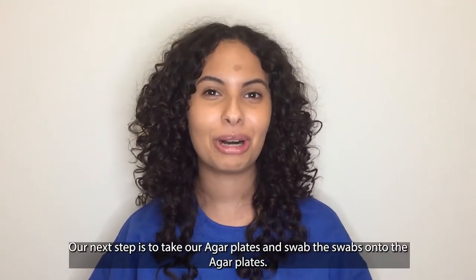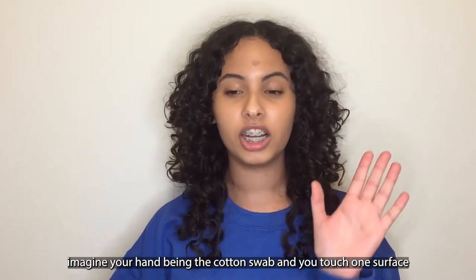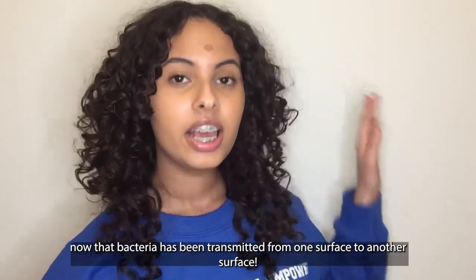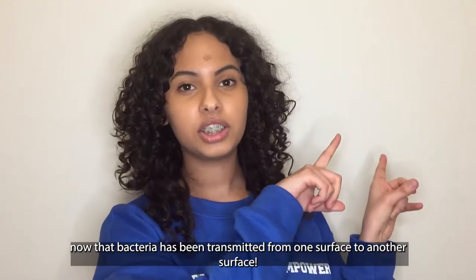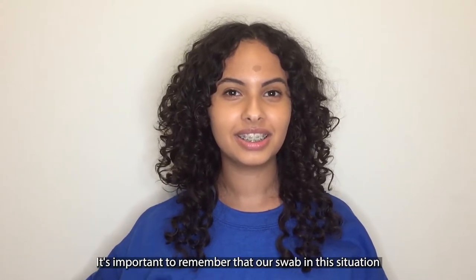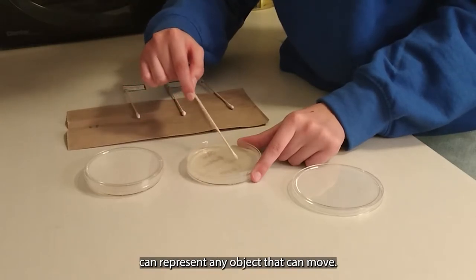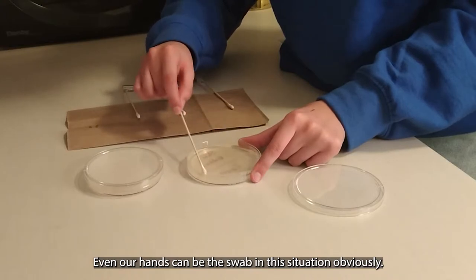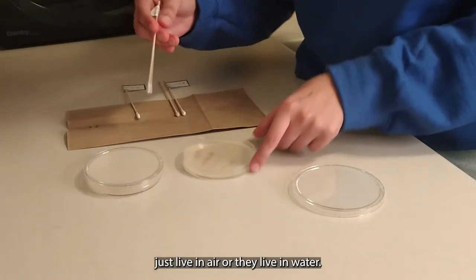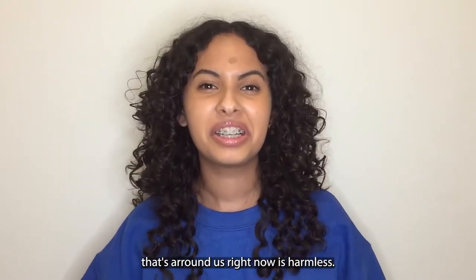Our next step is to take the agar plates and swab our swabs onto the agar plates. Imagine your hand being the cotton swab — you touch one surface and then, without washing your hands, you touch another surface. Now that bacteria has been transmitted from one surface to another. That is bacteria transmission — it's just the movement of bacteria. It's important to remember that our swab can represent any object that can move, even our hands. Some bacteria don't even need objects to live on because they can live in air or water. Most likely, the bacteria being spread around us right now is harmless.